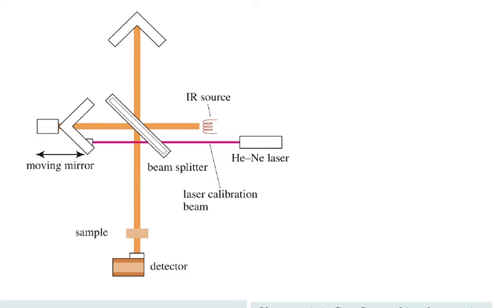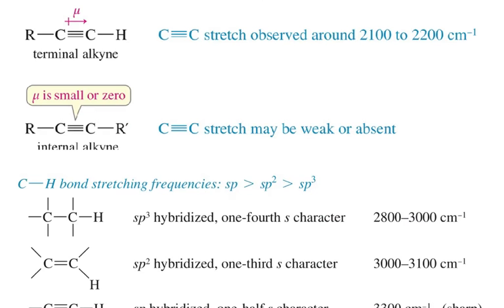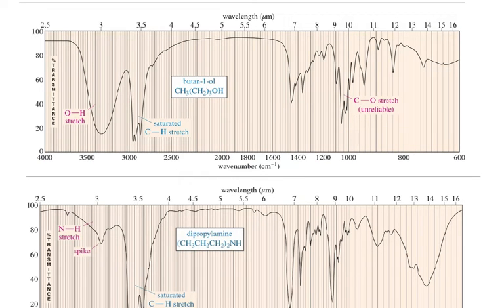without spending your money on a very expensive prism. So actually, before I start explaining different frequencies, I want to show you what an infrared spectrum looks like. Please ignore the labels for now, because we're coming back to this one and then we'll talk about the labels.